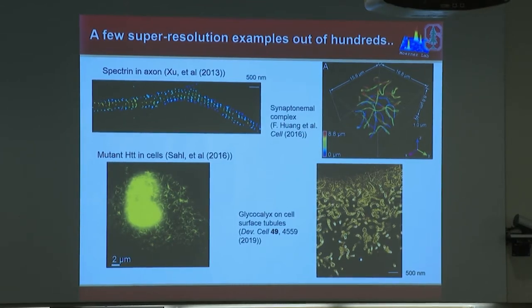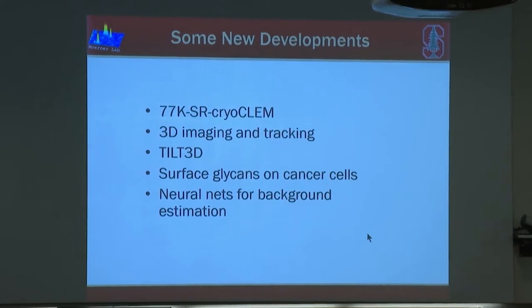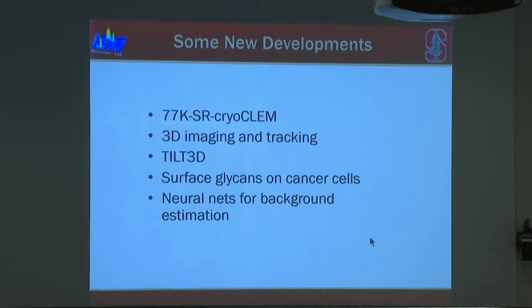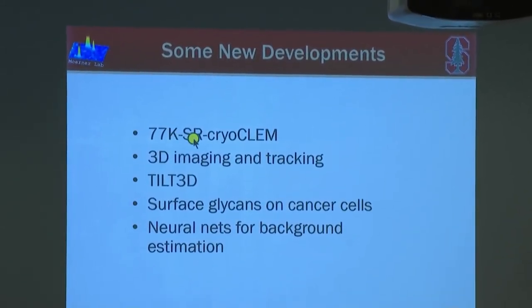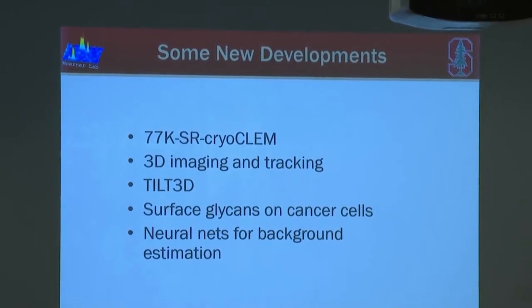So since, as I said, I can't summarize this whole field by myself, what I'm going to talk about now is some of the new things we've been doing that are designed at pushing super resolution forward, pushing single molecule measurements into other regimes. So I'm going to talk about going back to low temperatures briefly, talk about in a little bit more detail how we do our 3D imaging, and then explain this tilt 3D microscope.